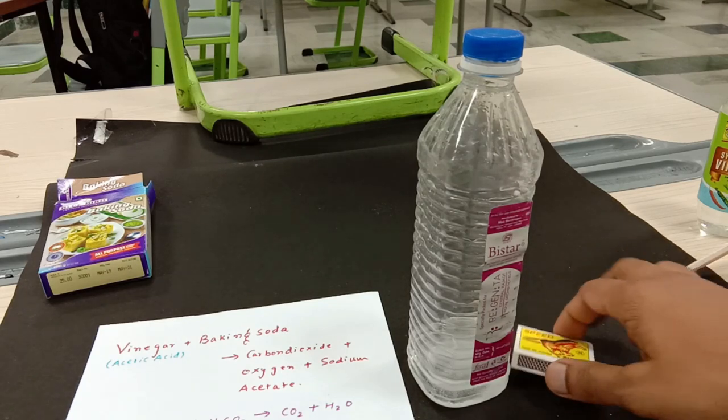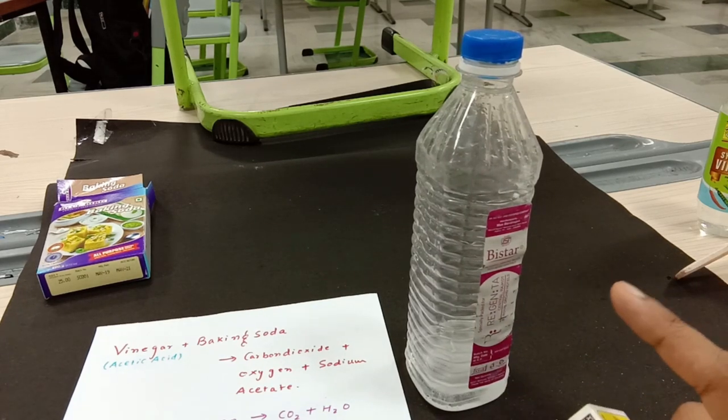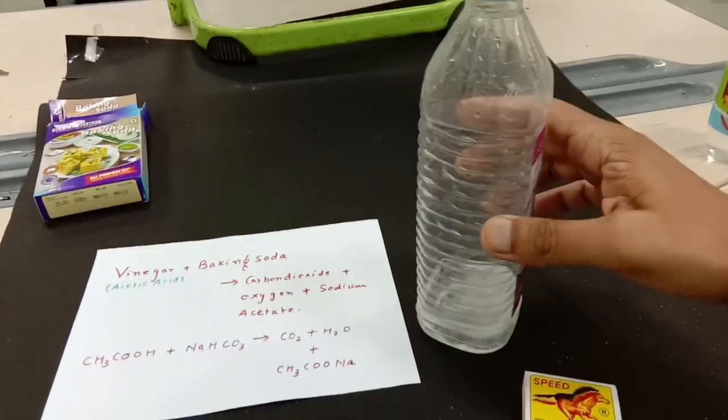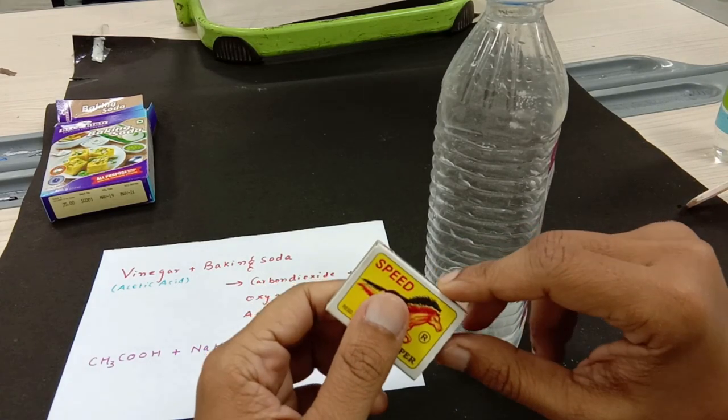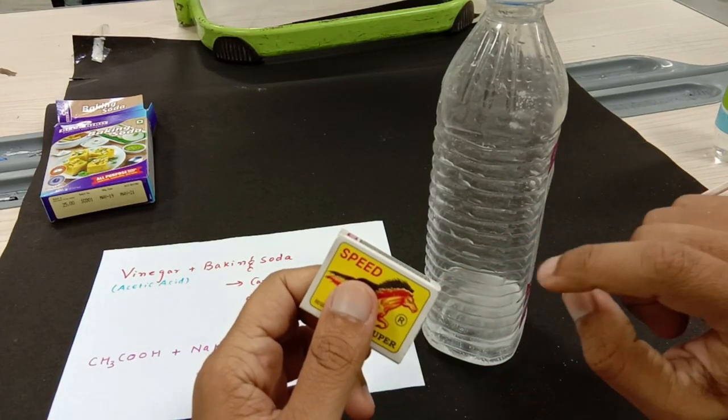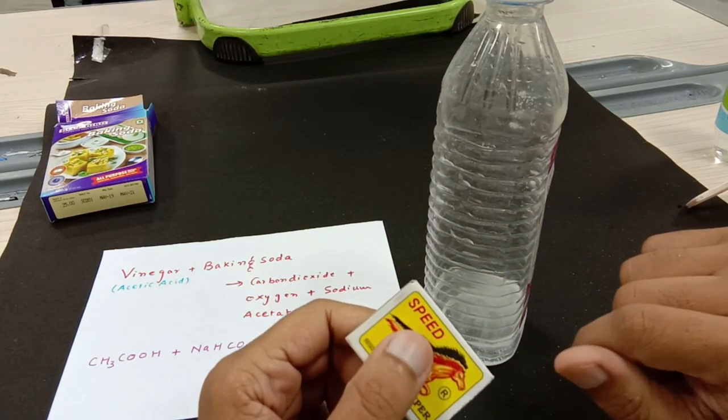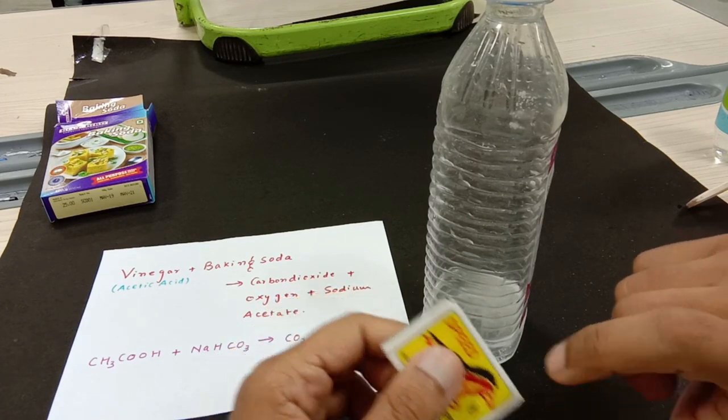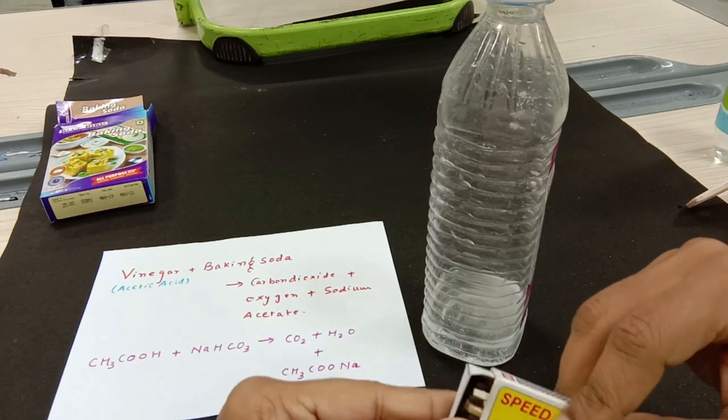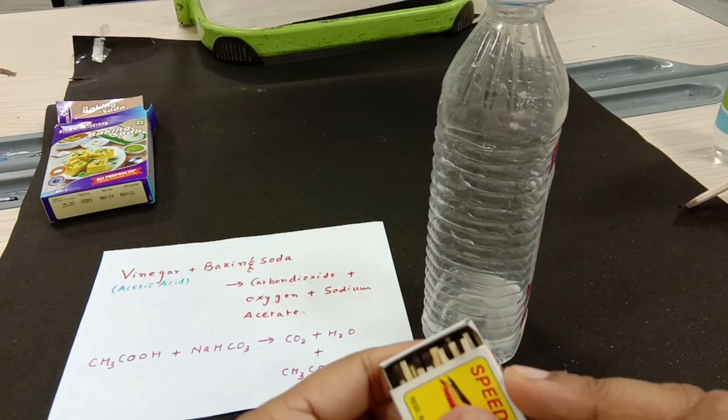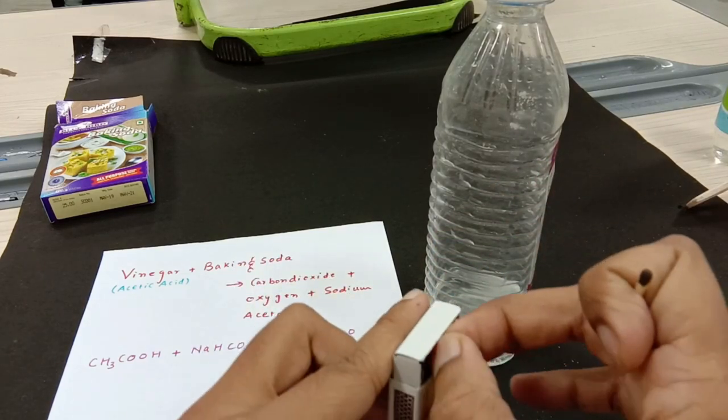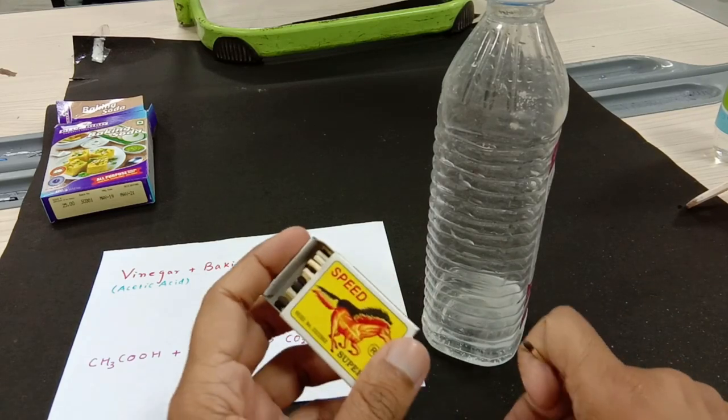Since I want to check whether this gas inside is carbon dioxide or not, I am going to take a burning matchstick and I am going to put it in. We know that carbon dioxide is a non-supporter of combustion, so the flame will extinguish. Let me take a matchstick. We will do it twice to double check our results.